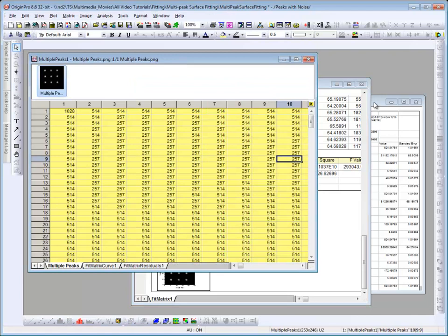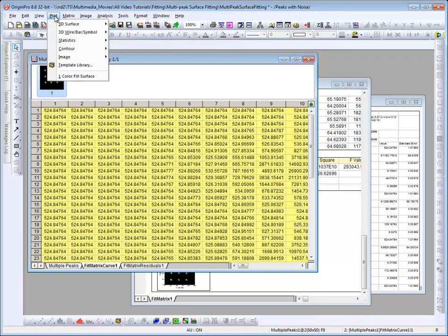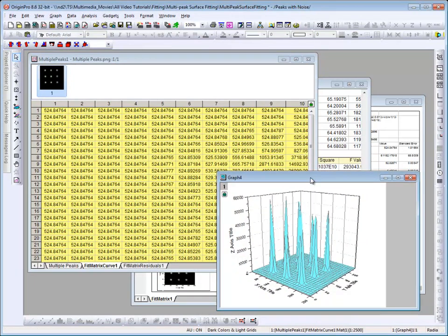A nice way to display a fit surface and the results is to plot the original data as a scatter plot and plot the fit curve as the surface. To do so, I go to my fit matrix sheet, plot as a color fill surface — and so this is our fitted surface.